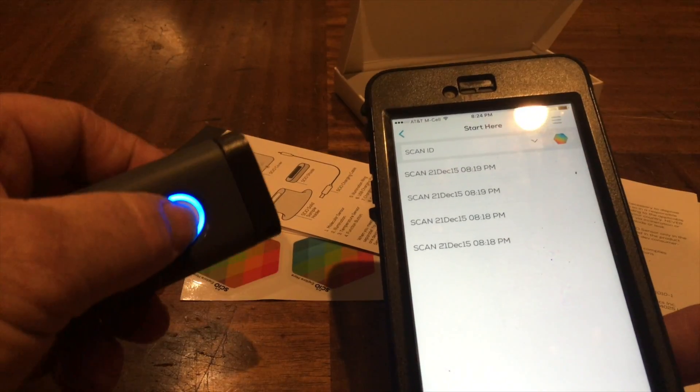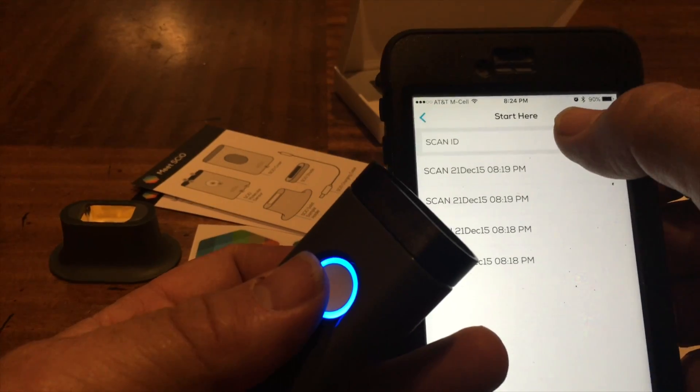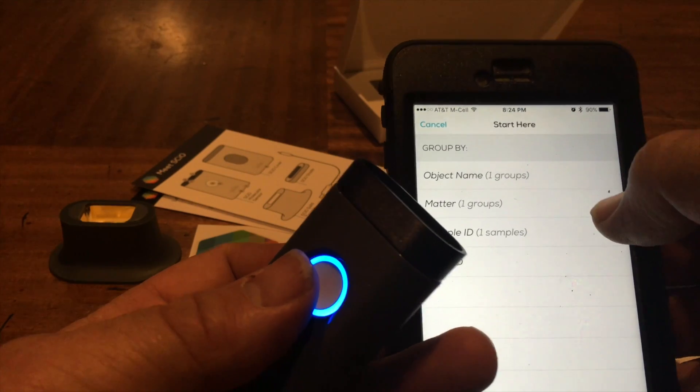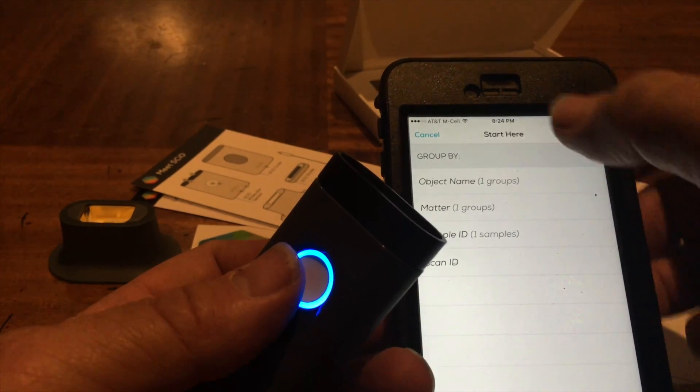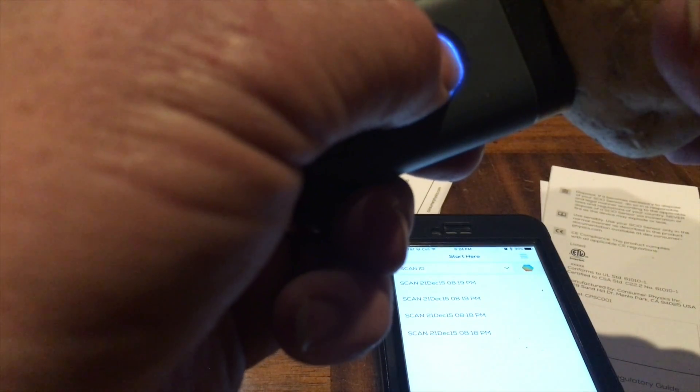What if I scan at this point - will it do anything? Scan ID, group by. Nope - didn't do anything.